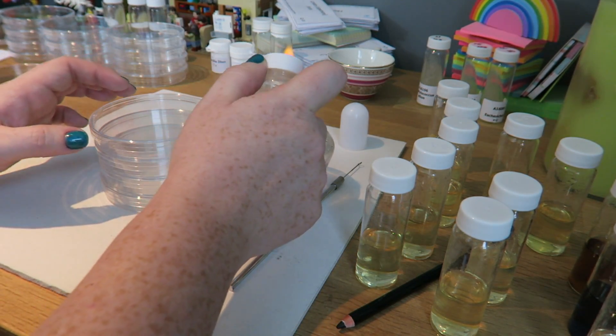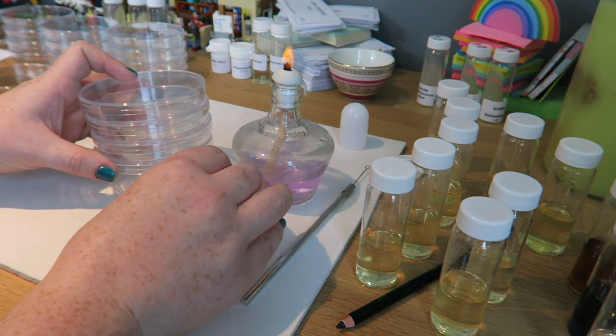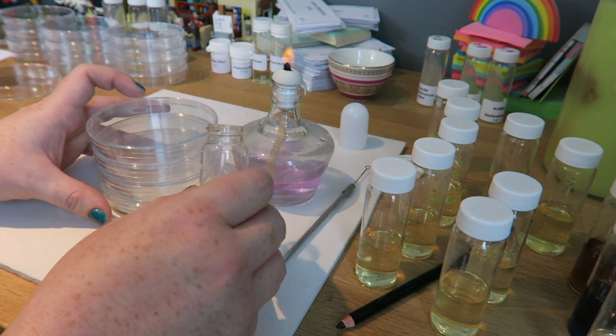What you need to do is take the lid off with your right hand, discard it, flame it, and pour. Perhaps giving it a little bit of a swirl to make sure it goes everywhere.